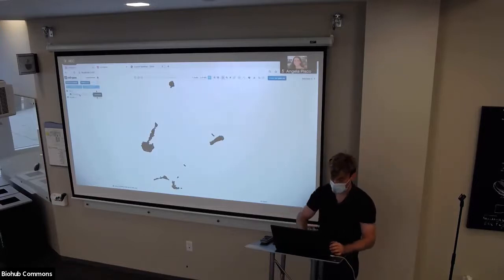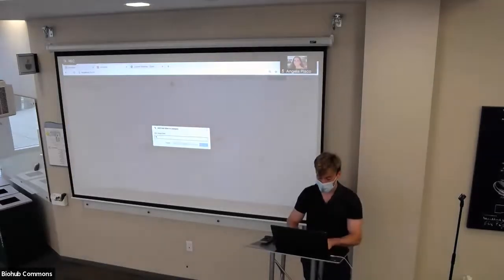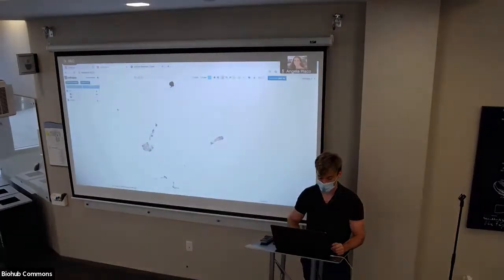unassigned. So now what you can do is, there's this tool here to the left of this plus sign in the menu bar. It should be automatically selected at first. It's a lasso selection tool. So you can circle a cluster, and then you can hit this plus button. Hovering over it reveals a tooltip that says add a new label to this category. And then you can say, we'll call it population A, and we'll say add label and assign 356 selected cells. So it's going to add the label and then assign all the cells that are selected.